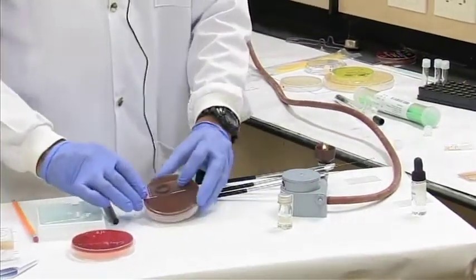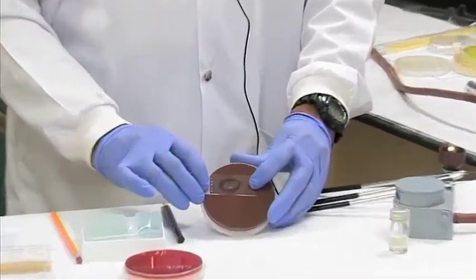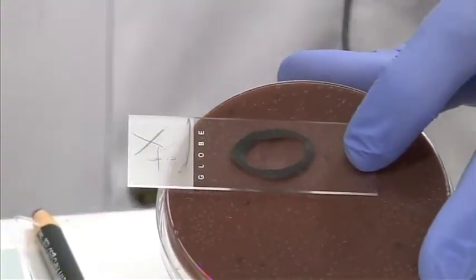So when you make your smear, I'm not sure if you can see this properly, but you'll see the suspension being a very light, milky suspension. You don't want it too heavy or too dense. If it's too thick, it will affect the staining process and the outcome.